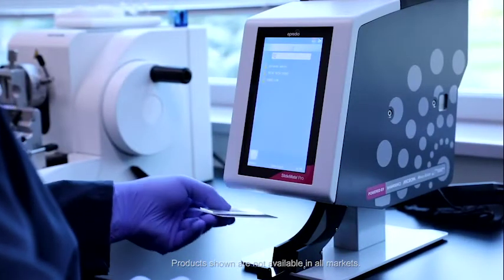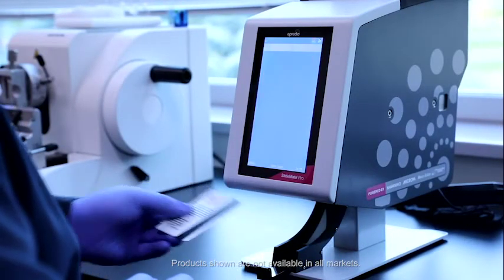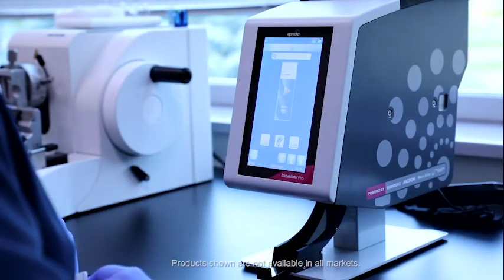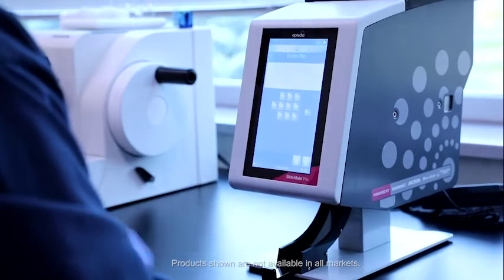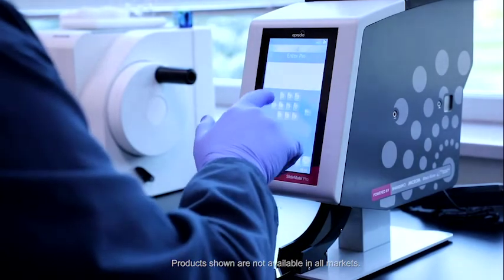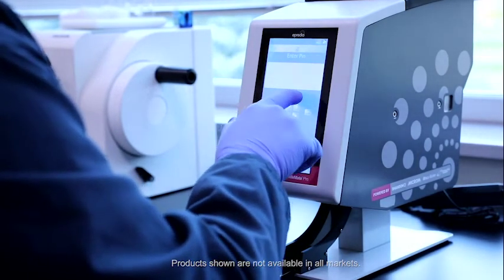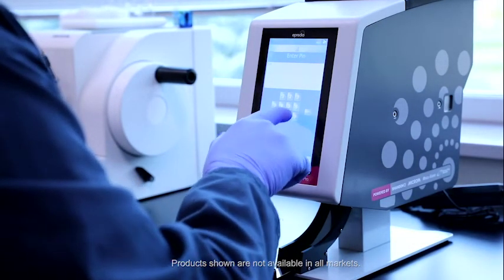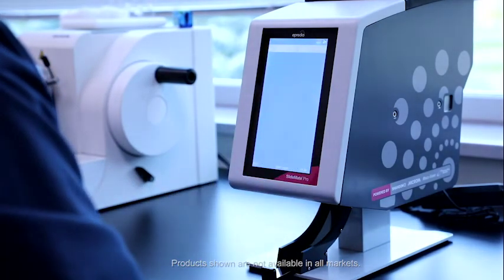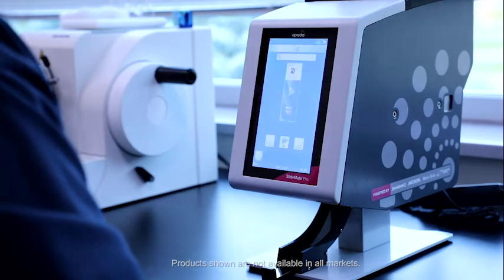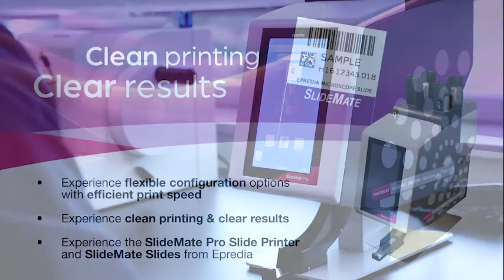The printer features an intuitive Windows-based operating system and fully integrated barcode scanner. Its small footprint fits next to the Microtone to help you fully achieve an optimal on-demand workflow.